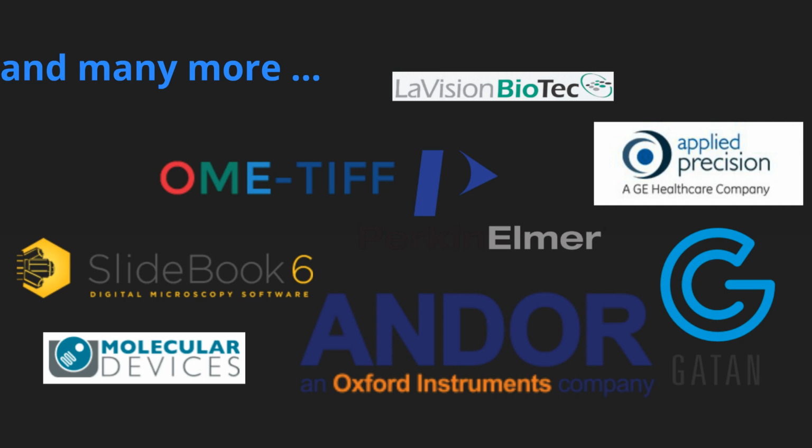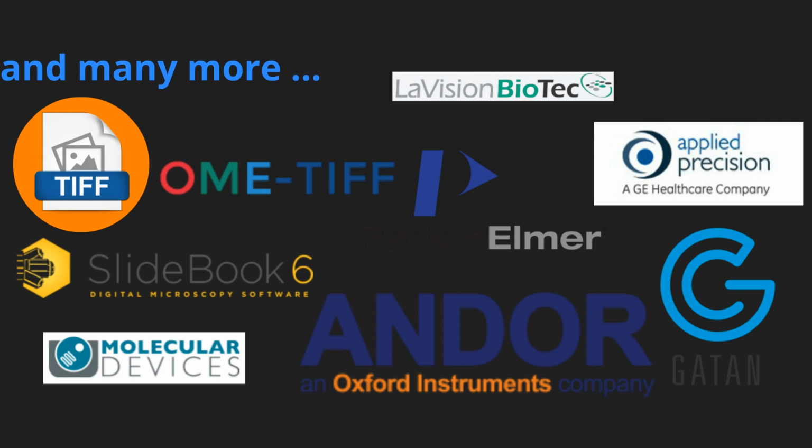One that's missing on this list is a TIFF file. So I want to talk to you about TIFF files. They work perfectly fine. You can import them, no problem. Everyone uses them. They're universally supported. You can open them anywhere you want. One big issue with a conventional TIFF file is it does not store metadata. It has no information for us to be able to pull out what the step size was, what the pixel resolution is, all of the things that we use to build that 3D volume. So TIFF files in general will require you to enter that information in by yourself.